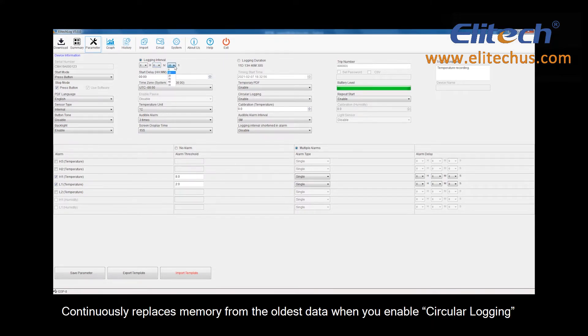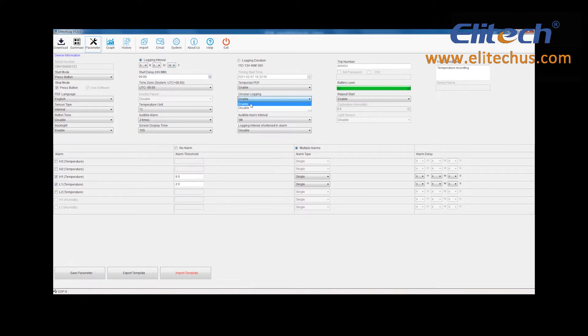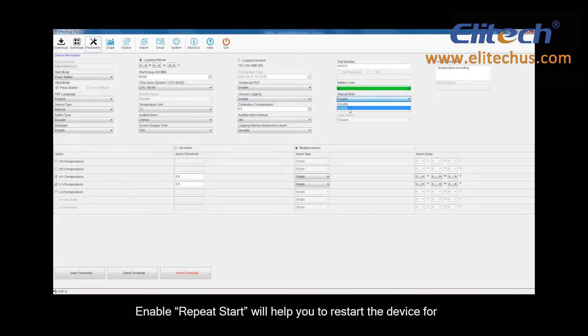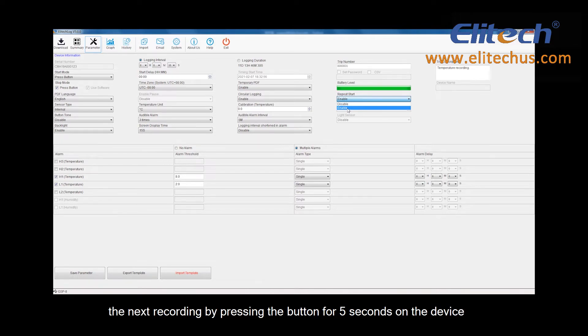Continuously replaces memory from the oldest data when you enable circular logging. Enable Repeat Start will help you to restart the device for the next recording by pressing the button for 5 seconds on the device.